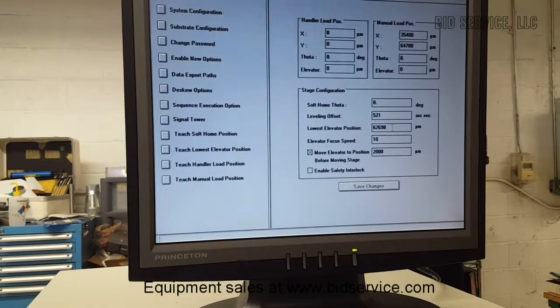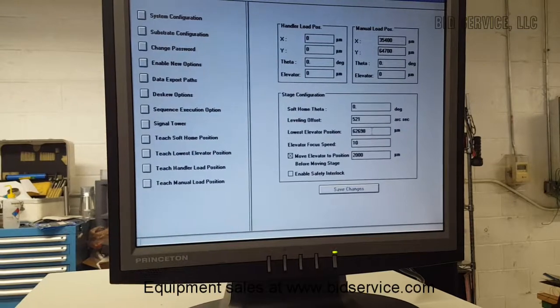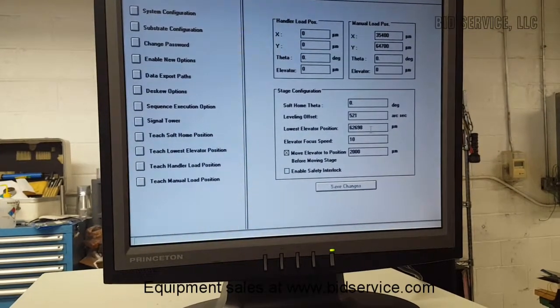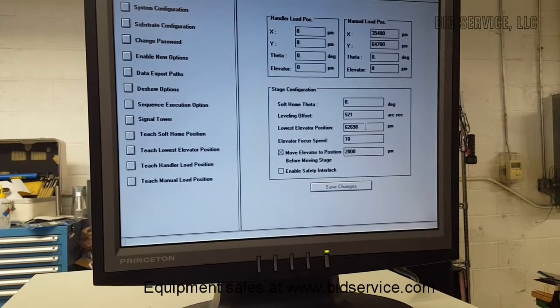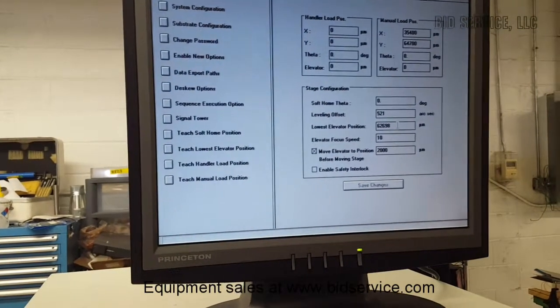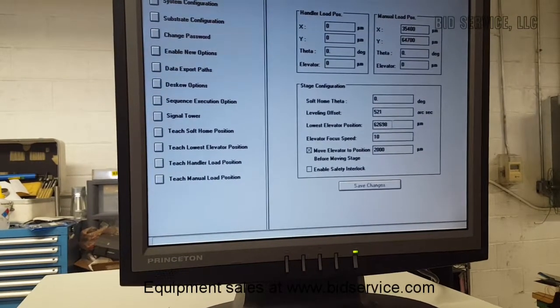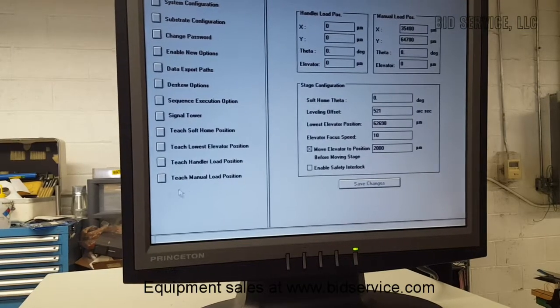After the touchdown, the number here should be corrected to add about 150 to 200 microns, so that no further down travel will be possible. This is to prevent the tower from crashing onto the sample and causing various other problems.